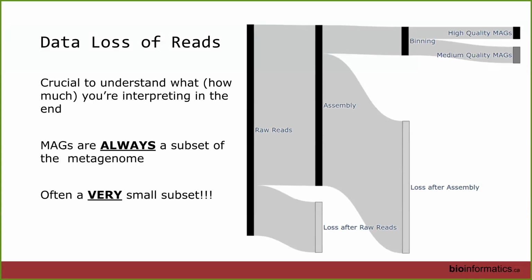And this is why I spend a lot of my time trying to integrate different omics data. Being able to contextualize your MAGs within your assembly and your assembly within your environment and so on and so forth is very important. Go ahead.